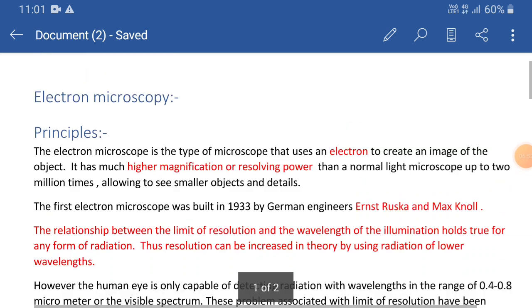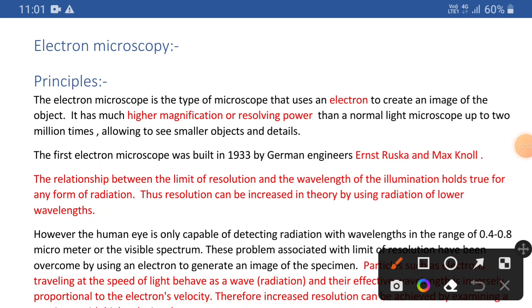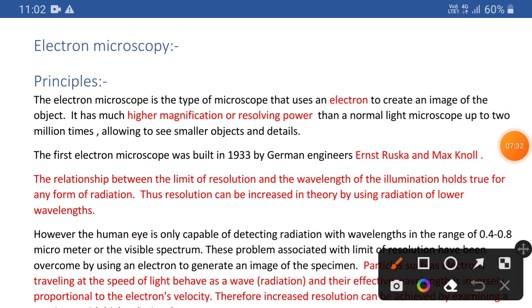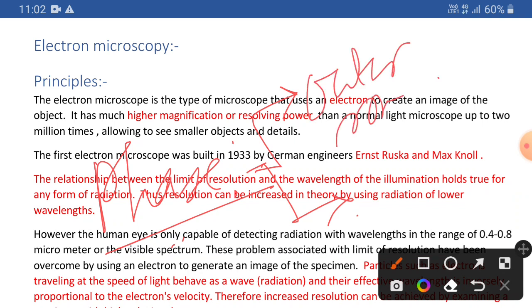After getting great success in that too, scientists thought we are now capable of distinguishing anything, right? Now our goal should be to visualize what is present inside the cell. Because yes, light microscopy helps you visualize the outer structure of a dead sample, no doubt about this. Dark field microscopy helps us visualize the relative outer structure of a live cell, and phase contrast microscopy provides the detailed outer structure. Phase contrast microscopy also helps you detect various inner structures, but there is a limitation.